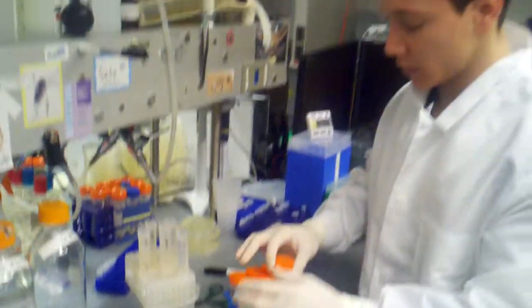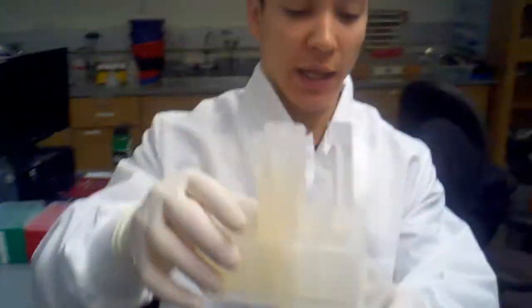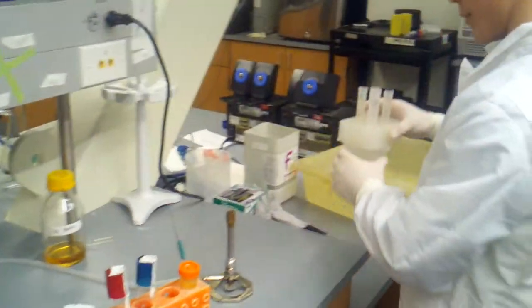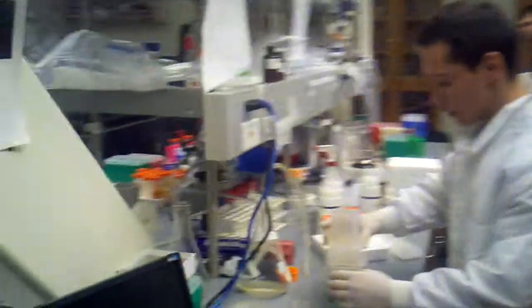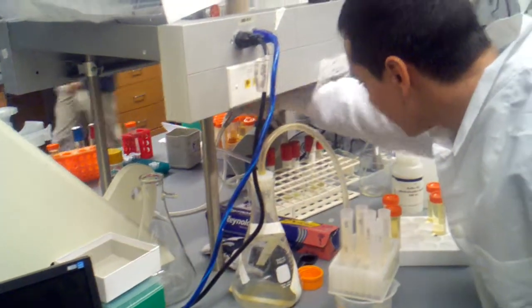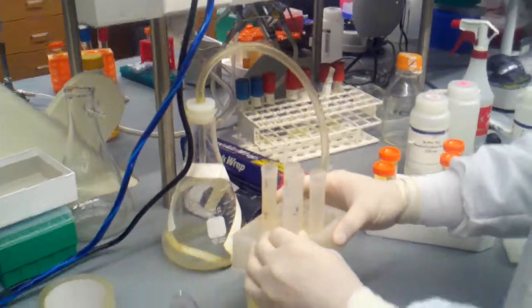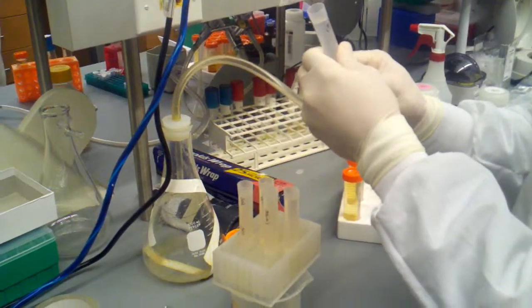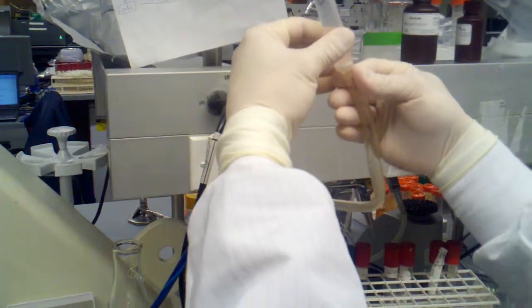Now all of our liquid is poured into here, but it's not flowing, which we're about to deal with. In order to get it flowing, we're going to come all the way around here to the vacuum, and we're going to turn on our vacuum. We want to do this so that the liquids don't get sucked into the vacuum system. In order to get this started, we're just going to give a quick little blast of vacuum right there. You want to watch, so you don't want to have it go too much. Oh, there we go, and now it's flowing.